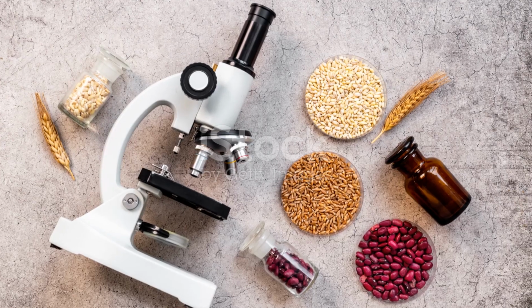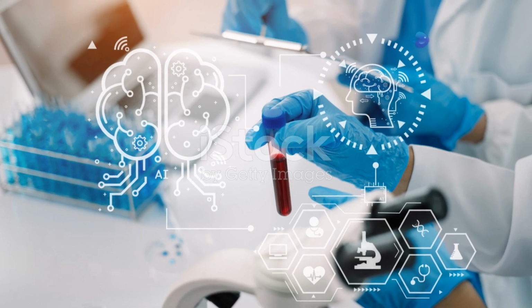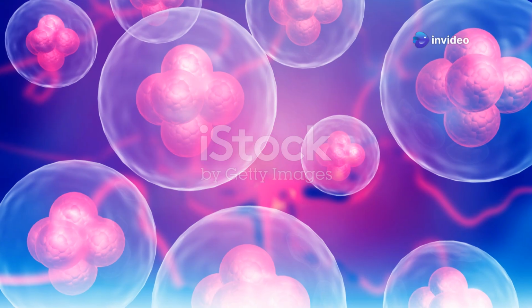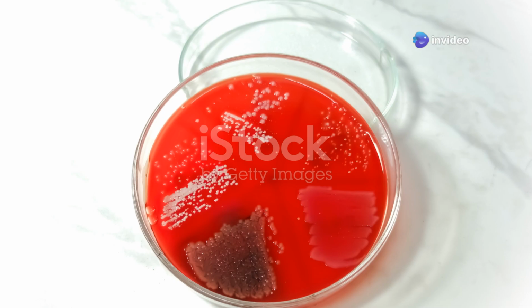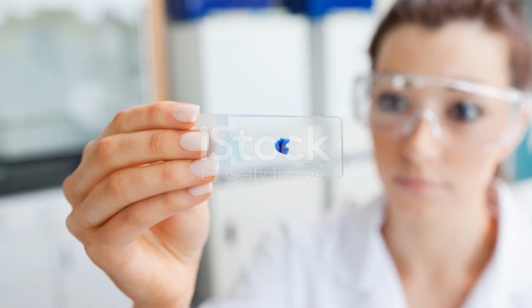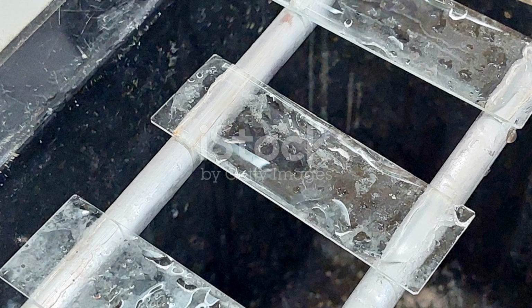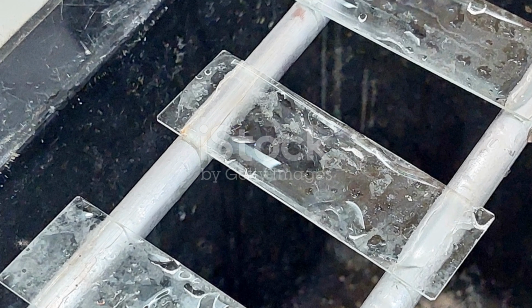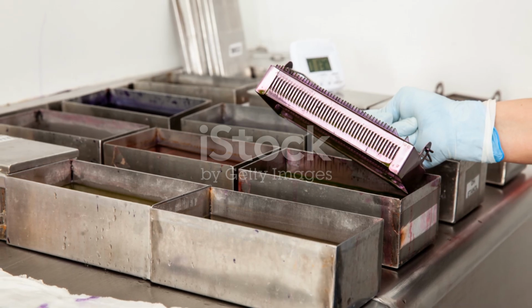After a quick rinse to stop the decolorization process, we're ready for our final step, counter-staining with safranin. This pink dye will stain the decolorized gram-negative bacteria, giving them a contrasting color to the purple gram-positive bacteria. It's like adding sprinkles to our microscopic masterpiece. We rinse one last time and allow our slide to air dry. Now for the moment of truth. Are you ready to see what we've got?